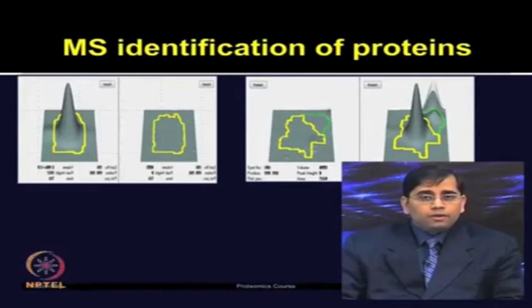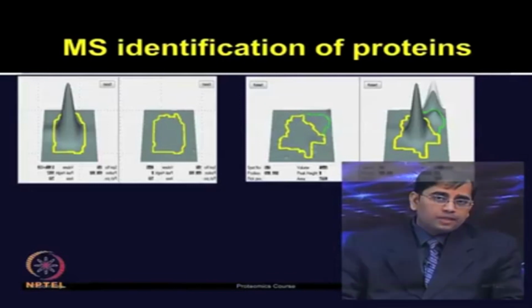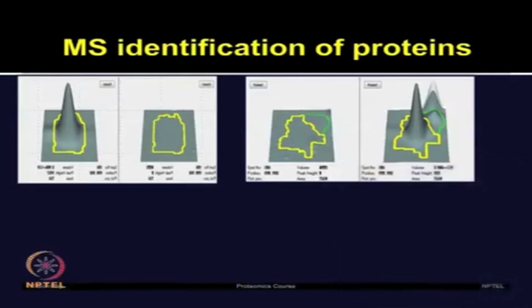They also found that there are 8 proteins which were overexpressed, and those included pigment epithelium derived factor, 2-HS glycoprotein, complement factor H related protein and leucine rich 2 glycoprotein. For a complete list of the proteins identified, you can refer to this manuscript. These are some of the interesting proteins which the authors identified.